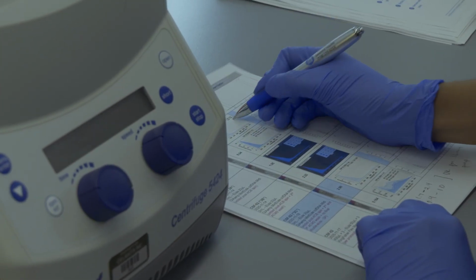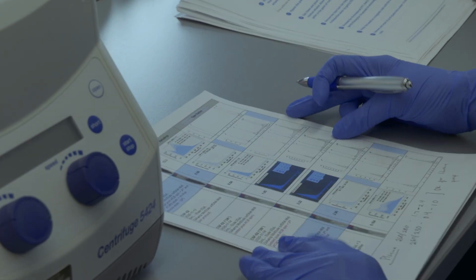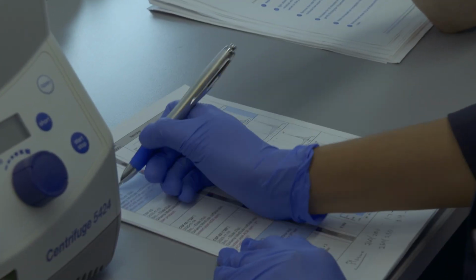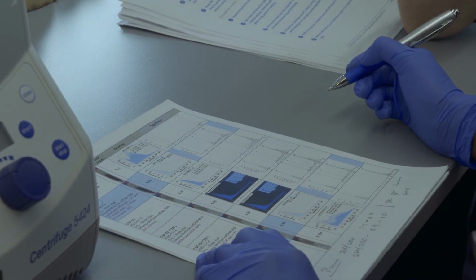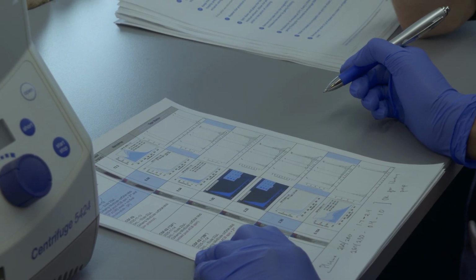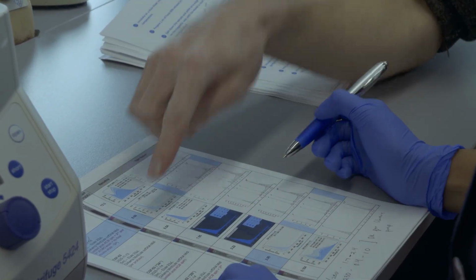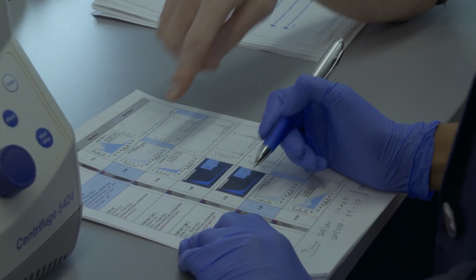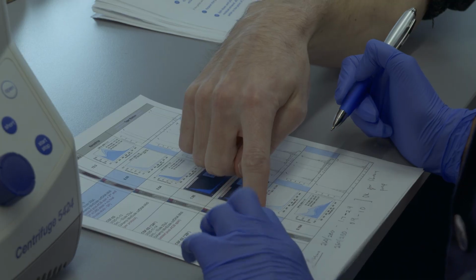Yeah. So this is actually, and is this plasma or CSF? This is CSF. The pictures here are just denoting how bloody it is. Oh, I see. Because I was trying to correlate the amount of potential gDNA contamination with bloodiness. As you can see, there's no real correlation, because this one's very clear. And you'll note this one is the same actual sample, 2A, 2B, 2C.